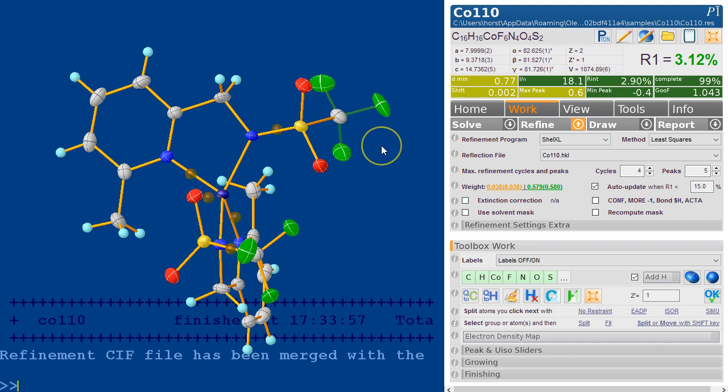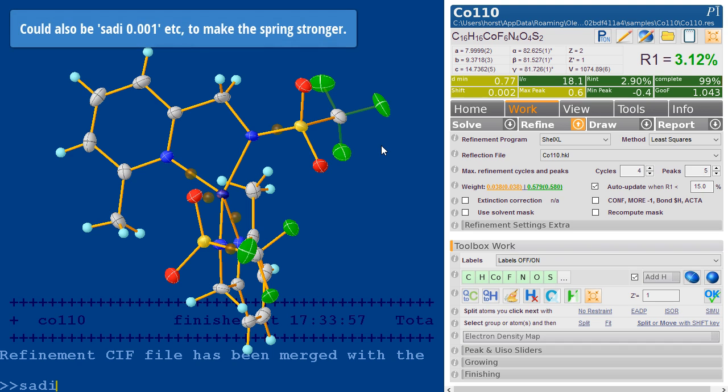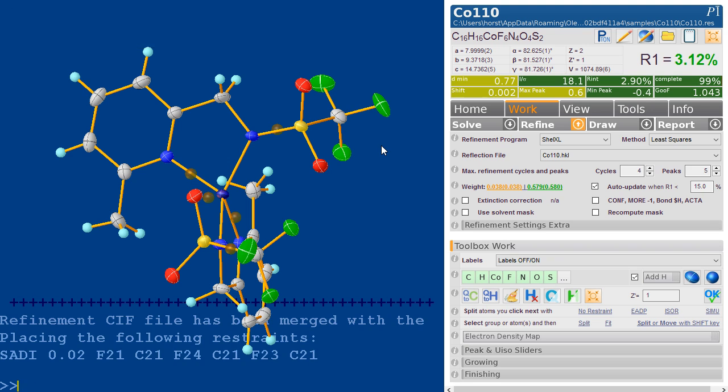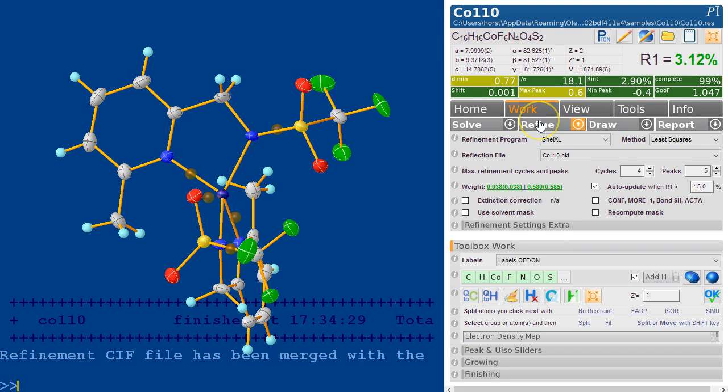you just select the three distances and type SADI, which is the familiar restraint for this particular restraint you want to put on here. This puts the SADI into the INS file. Once you press refine it puts it in. So again, there's no need to actually edit the INS file at all. It's all taken care of.